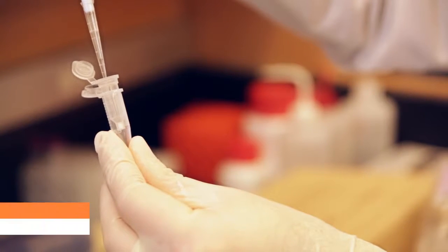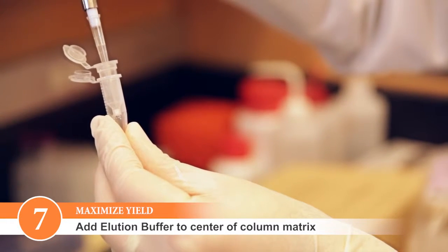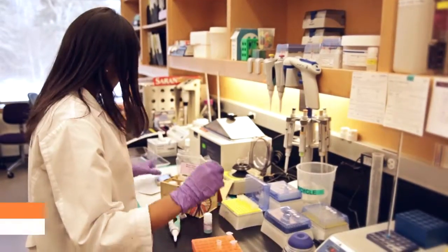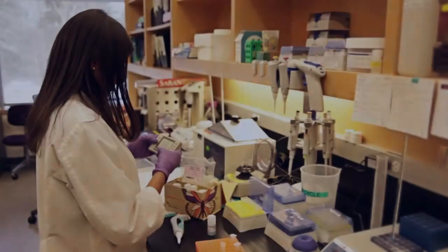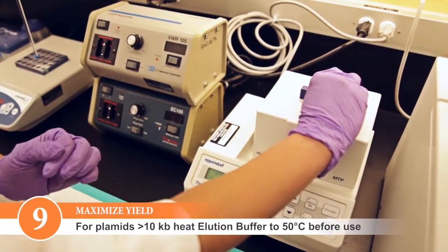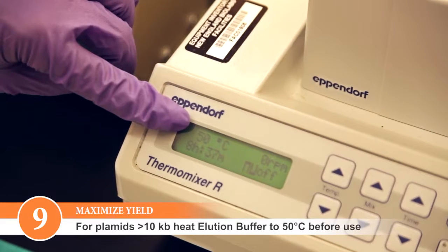Make sure that you add the elution buffer to the center of the matrix without puncturing it. The elution buffer needs to be in contact with the column matrix for efficient elution. Be sure to incubate the elution buffer in the column for a full minute before spinning. For plasmids that are larger than 10 KB, heating the elution buffer to 50 degrees Celsius prior to adding it to the column can improve yields.